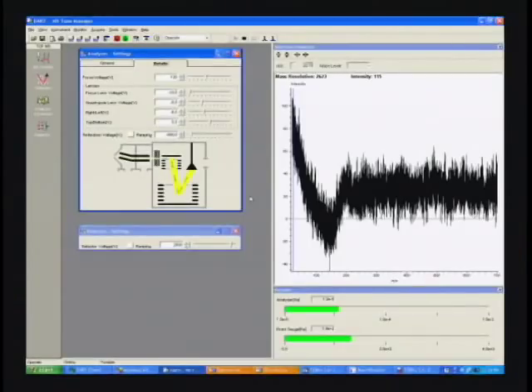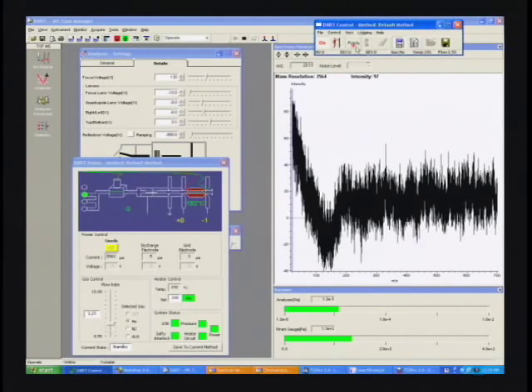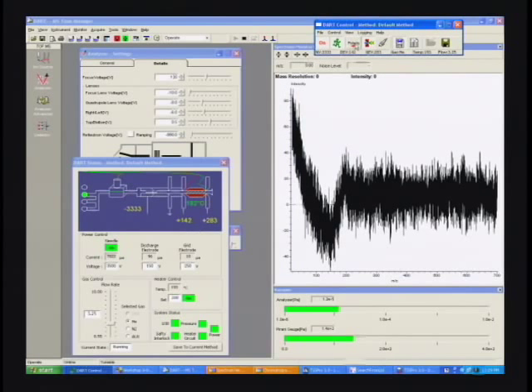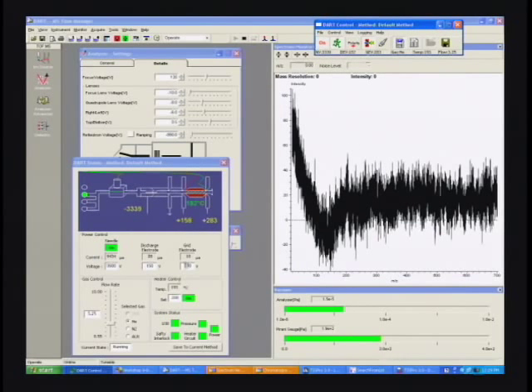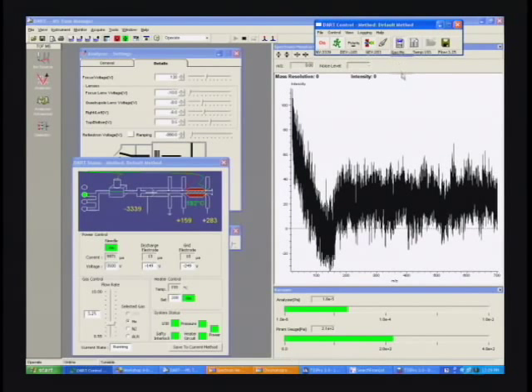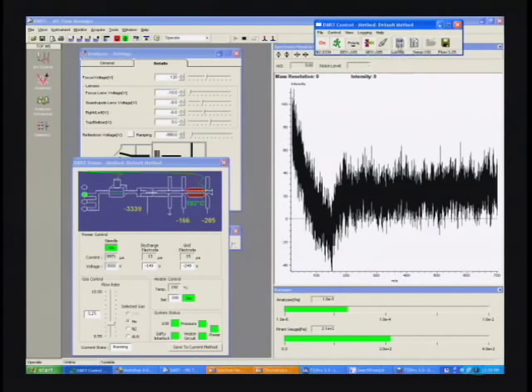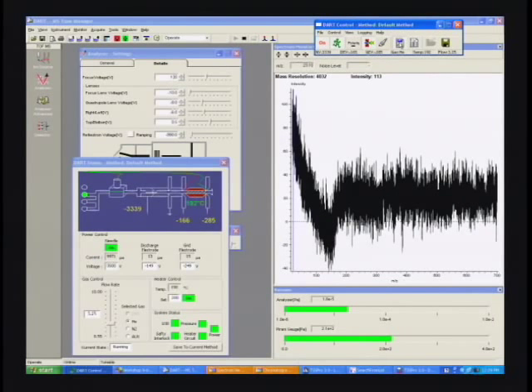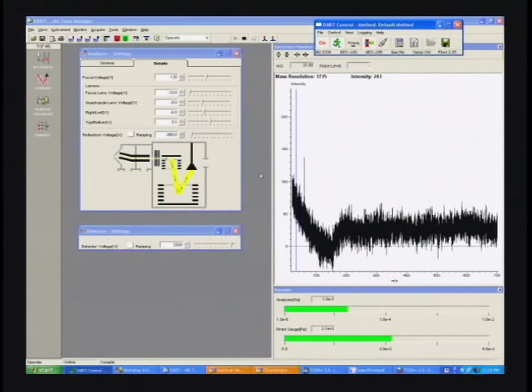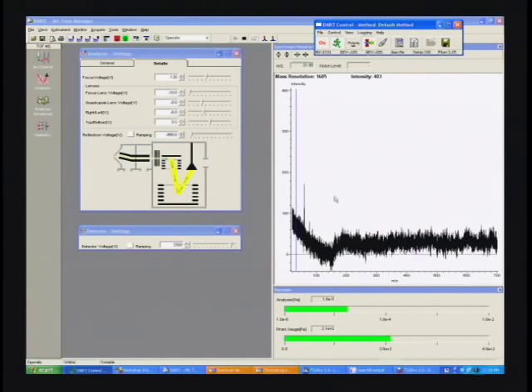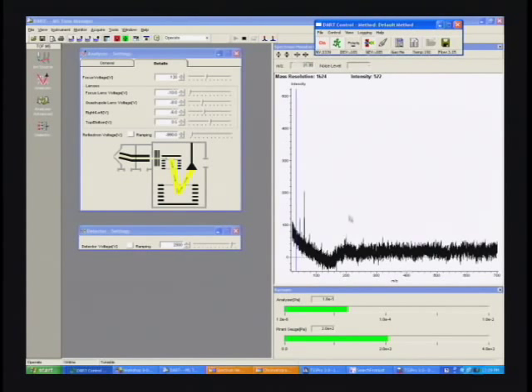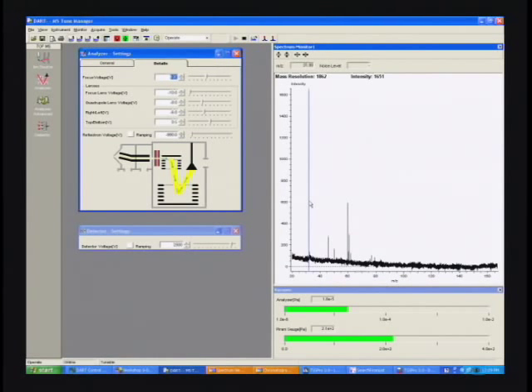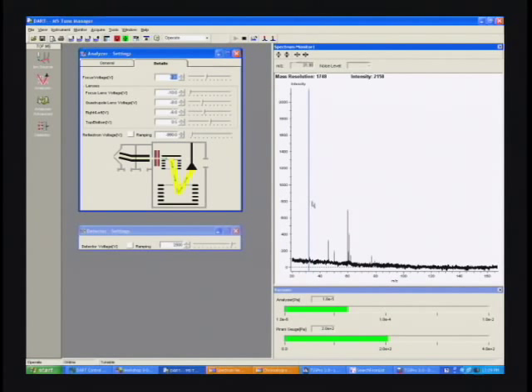Now we're up and running and the dart goes back on. We'll just switch the dart polarity. That's just going to change the two low voltage electrodes from plus to minus and now we're in negative ion mode. Let's take a quick look and make sure that we're getting some low mass peaks. The dart signal is stabilizing here. We're starting to see an oxygen peak at 32 grow in. So as soon as this stabilizes a little bit we'll go ahead and measure our sample.